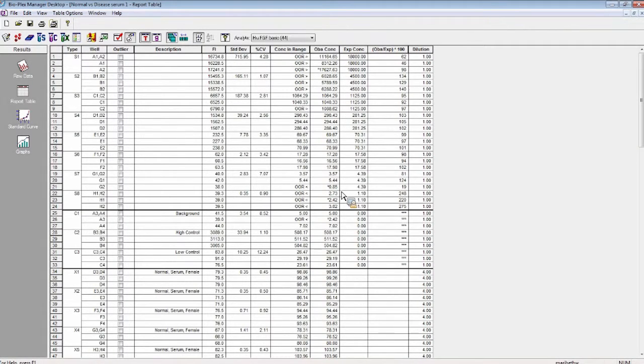Removing these points doesn't affect the sample quantitation, but does improve the overall curve fit. Since there are still 6 good standard curve values for basic FGF, the BioPlex Manager software can use 5PL regression for the standard curve fit. As I'll be showing, you can use the optimize function in the standard curve graph to do the optimization for you. Since the S1 and S8 standard curve points have poor recovery values, they will be marked as outliers. There are ways to do this manually if needed.